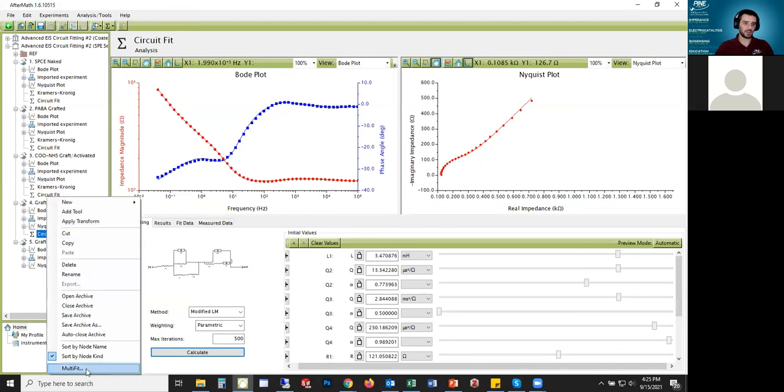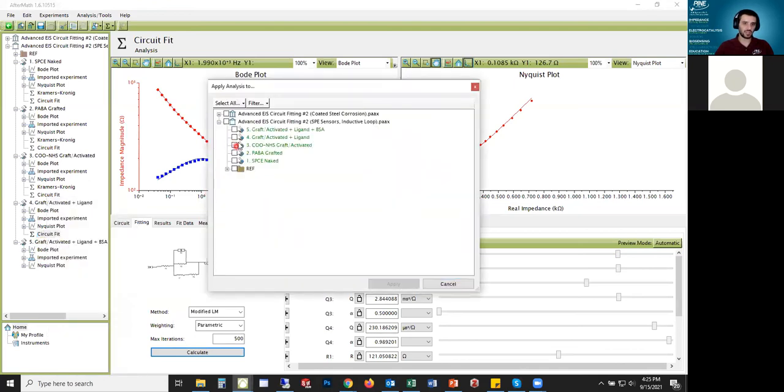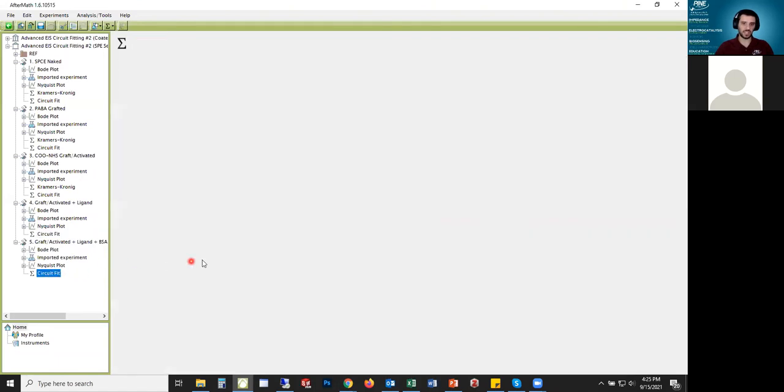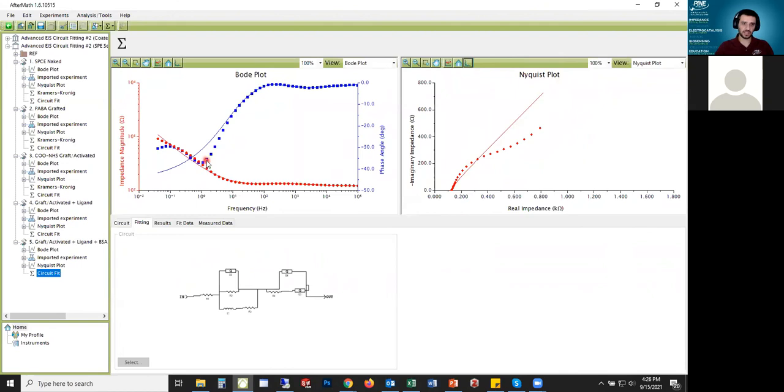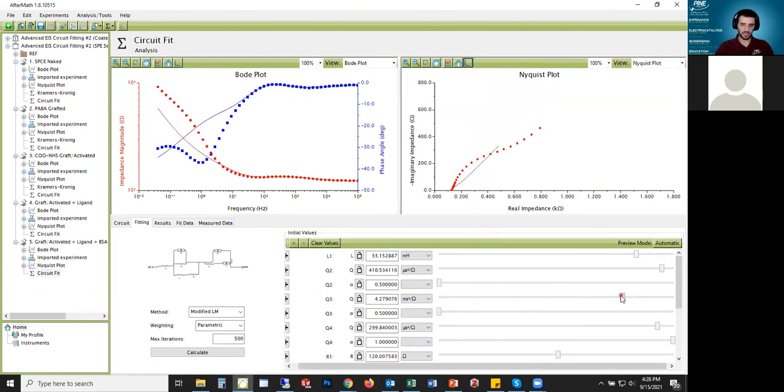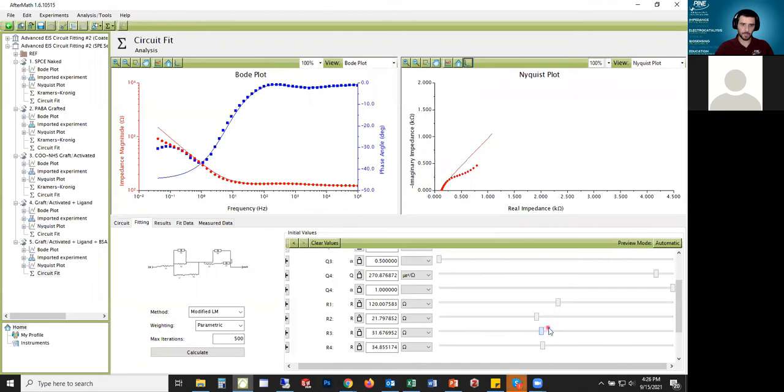So now what I'm going to do is I'm going to take this fit and I'm going to apply it to number five as well to try and get that last data set and see if I can get a fit for that loop as well. And let's see if this can get a good fit. So it appears like it's not quite matching that CPE there, so I think what I probably need to do is adjust some of these parameters. One of these CPEs is probably not quite right or one of these resistors needs to be adjusted to get that behavior that I'm looking for. So that one doesn't seem to be the one, and if I mess with this one that seems to get that behavior. See now I'm getting kind of that shape that I want, so let's see if this kind of locks into place. Yeah there we go, that seems a little better.